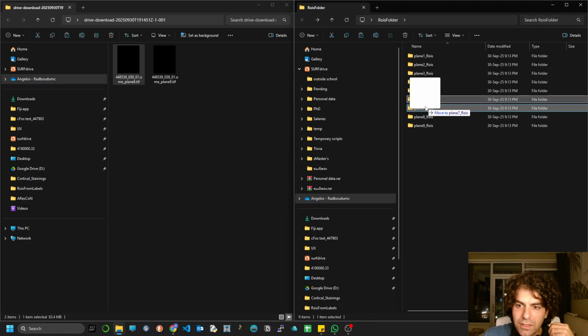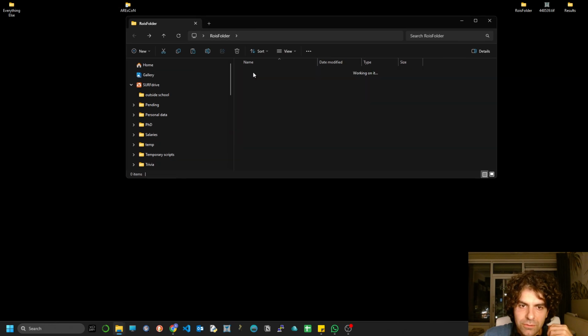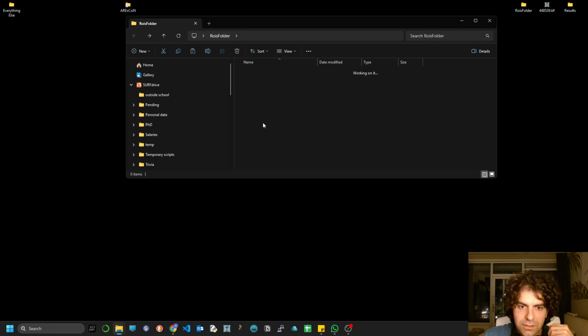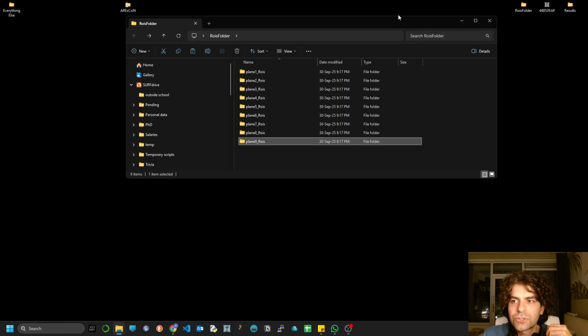7, 8, and 9. Cool. Let's see if it's done correctly. 1, 2, 1, 2, 2, 2, 3, 4, 5, 6, 7, 8, 9. Awesome.